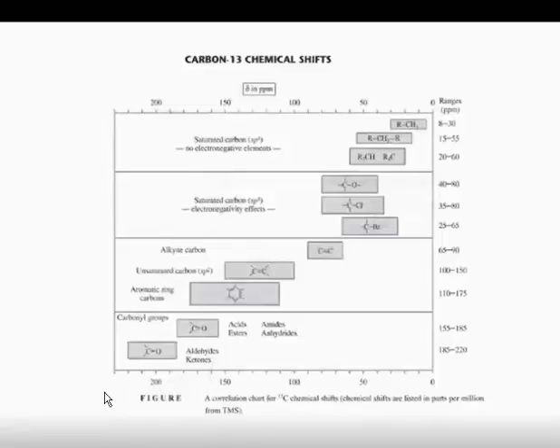In this chart, you're going to see the same kind of chemical shift effects that we saw for proton. You see the effects of inductive electron withdrawing and donating groups, and you also see the effects of magnetic anisotropy, the effects of the pi electrons of double and triple bonds and aromatic rings. For example, C13s of a hydrocarbon that aren't attached to electron withdrawing groups tend to have a lower delta value.